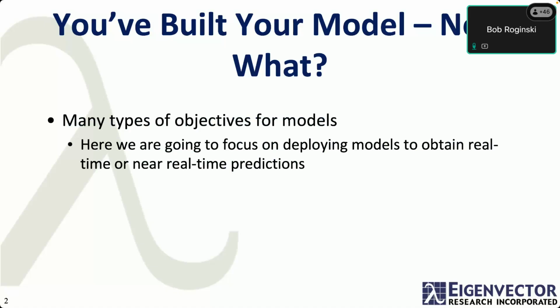In this instance, we're going to focus on deploying models that we are looking to get real time or near real time results from, or even samples that are pulled into a lab and measured, let's say spectroscopically, to take the place of a longer laboratory test or laboratory test that is not particularly safe to operate.